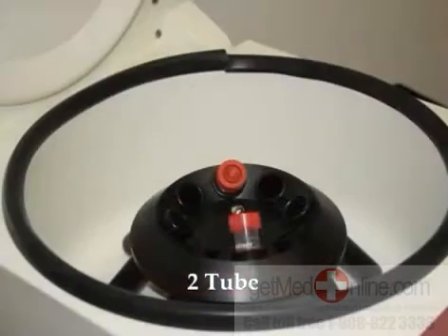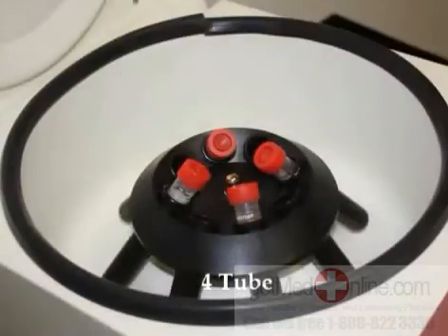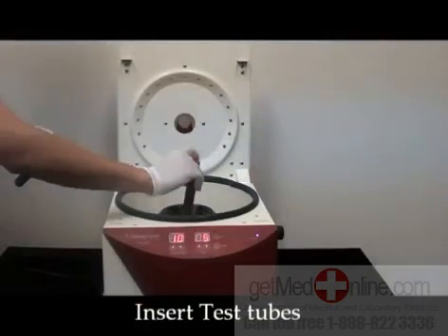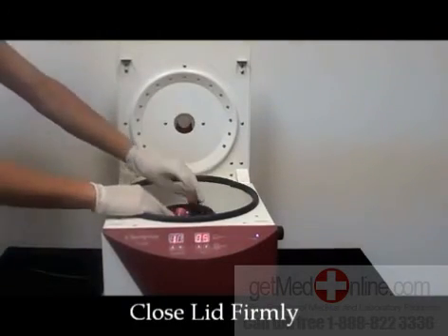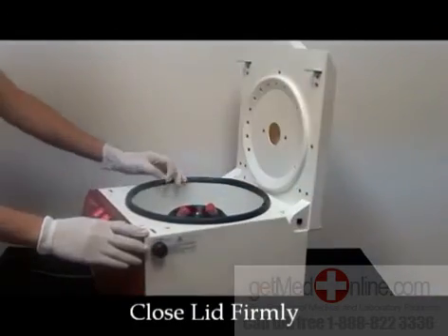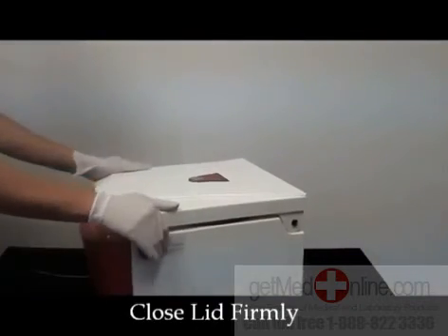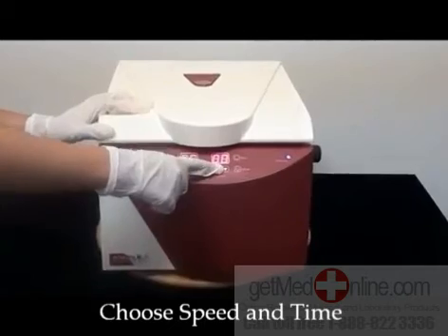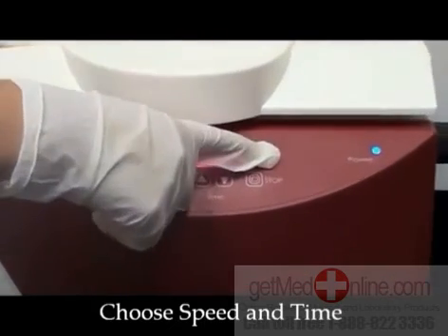Balance the centrifuge with either 2 tubes, 4 tubes, or 8 tubes. Insert your specimen, then push down firmly with both hands to close the lid. Make sure it clicks. Set the appropriate time and speed located in the front and push the run button.